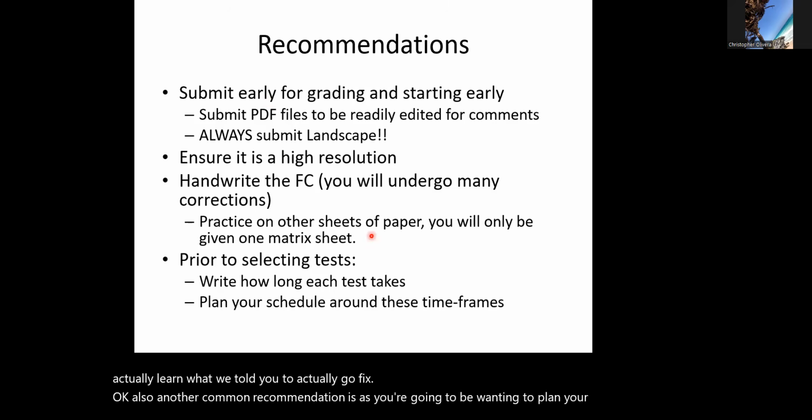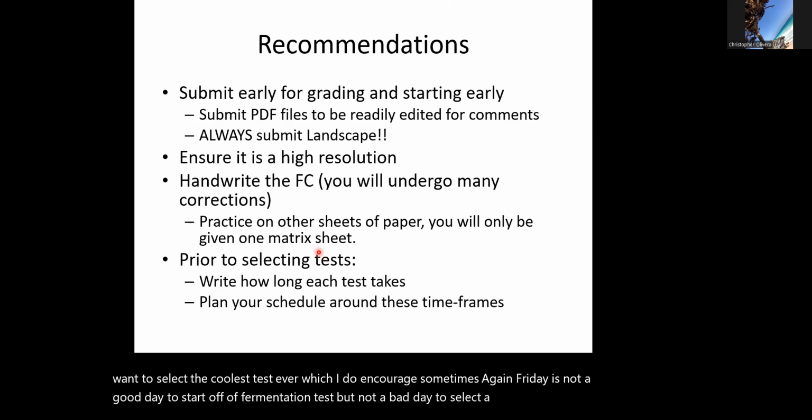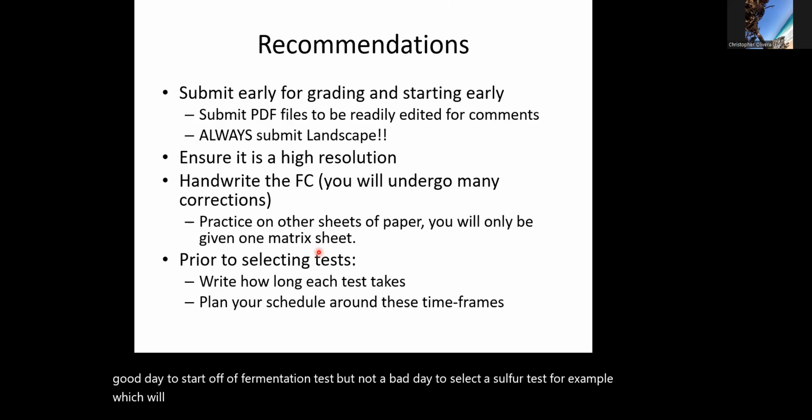Also, another common recommendation is, as you're going to be wanting to plan your time, make sure you're aware of the timings of your tests. Even though you might want to select the coolest test ever, which I do encourage, sometimes, again, Friday is not a good day to start off a fermentation test, but not a bad day to select a sulfur test, for example, which will last you 4 days. So plan accordingly. Prior to actually setting everything down, plan out your week, plan out your month, okay?